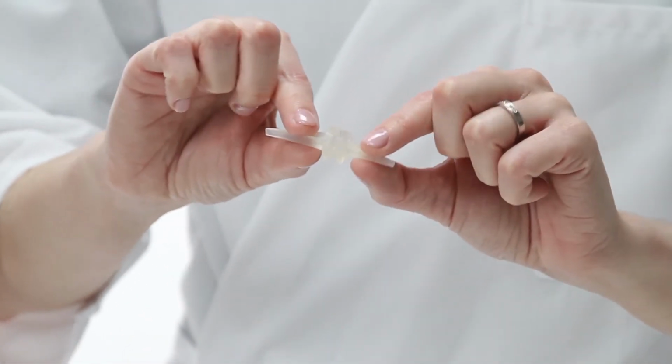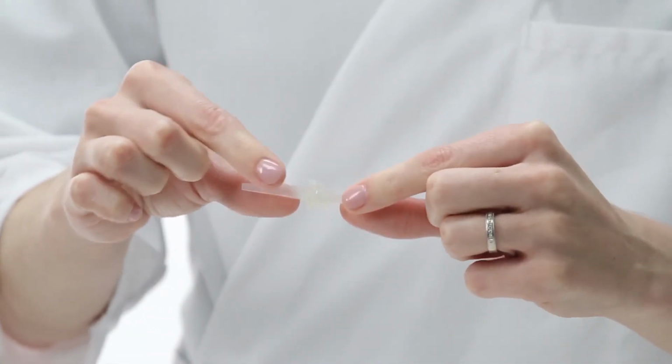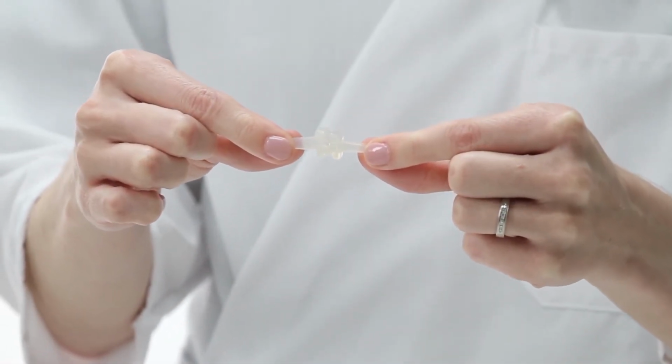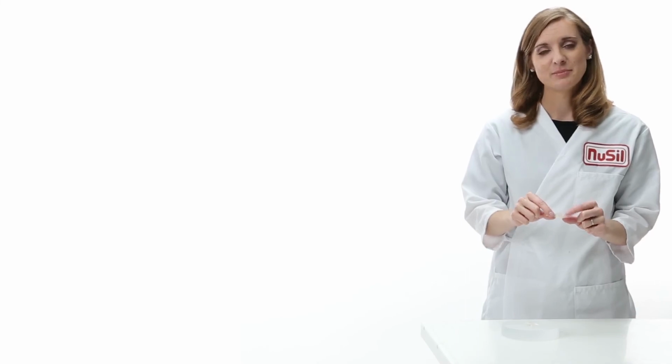We can now use these properties to help you determine what's critical to quality for your application. Take an artificial finger joint, for example. It will see a lot of stress because it's bent over and over every day, but not a lot of strain because it doesn't need to stretch very far. From what we've learned today, we know that an artificial finger joint needs something of high tensile, but not necessarily high elongation.